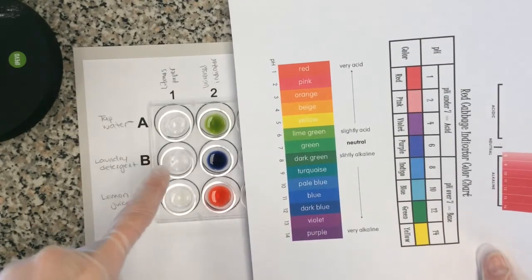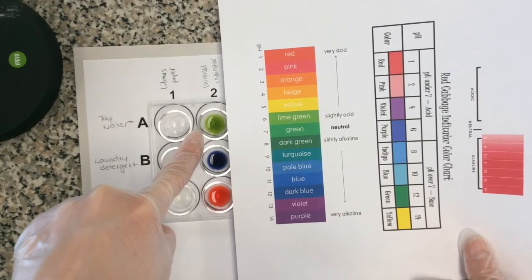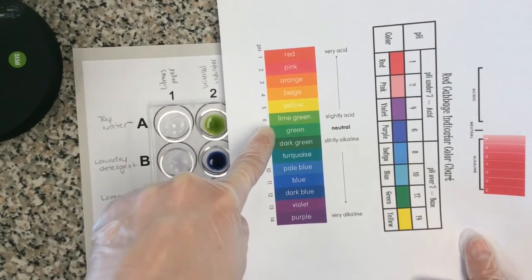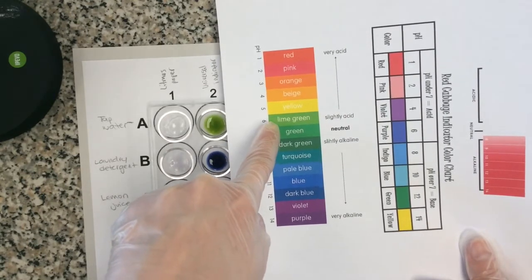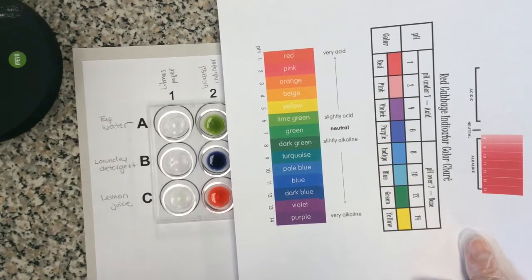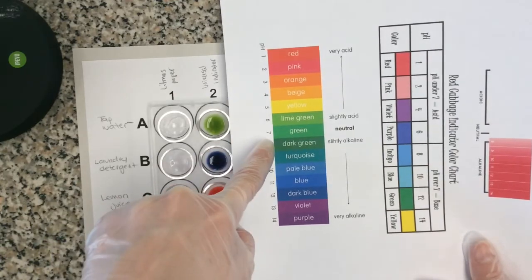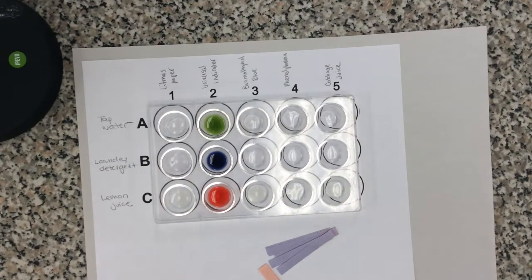Okay, so we're going to color match my tap water. I'd say that it's between lime green or green. Okay, so that means that this either has a pH of 6 or 7. So I'm going to say it's green. That's my guess. Okay, so it probably has a pH of 7. That is what that indicator is telling me.